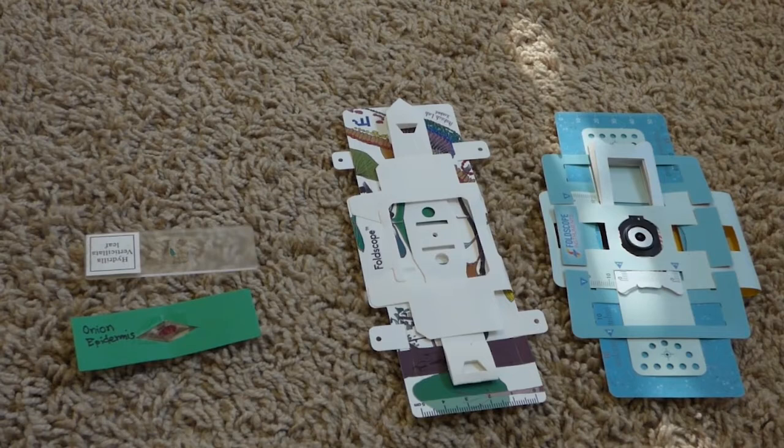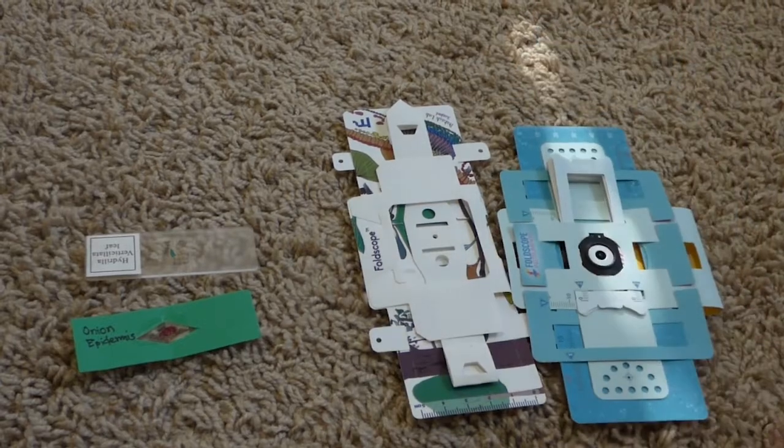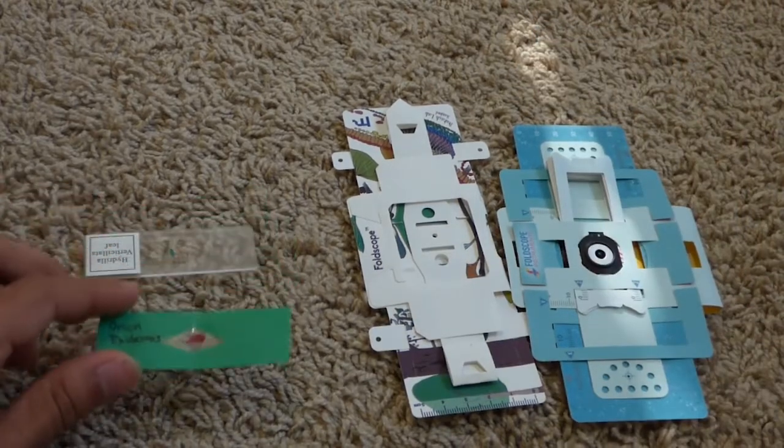First off, let's look at the materials that are required. We're going to need our Foldscope, along with the different types of slides that we're trying to look at.